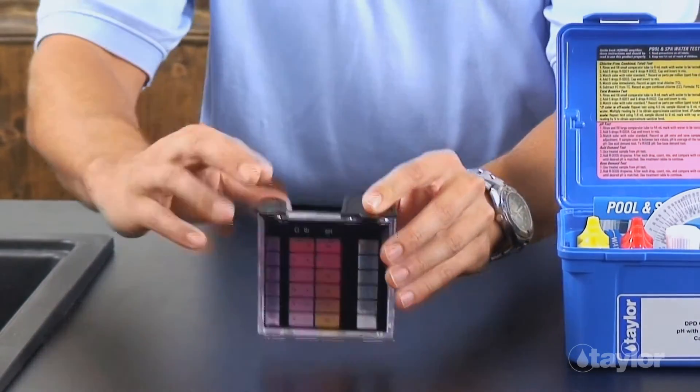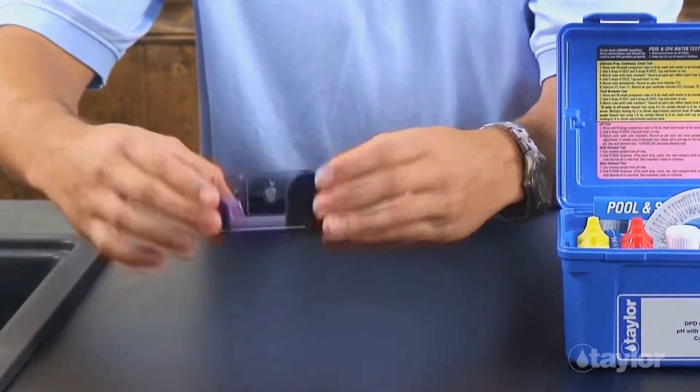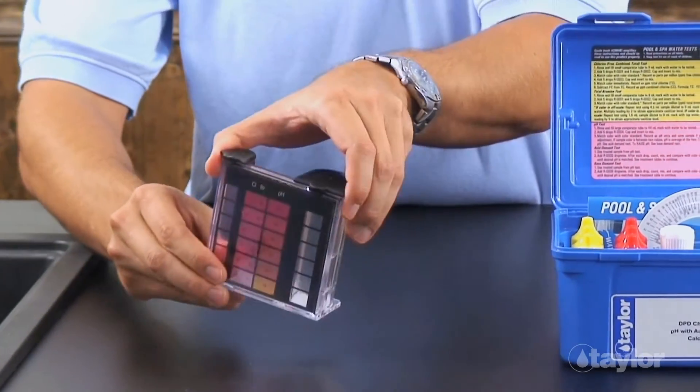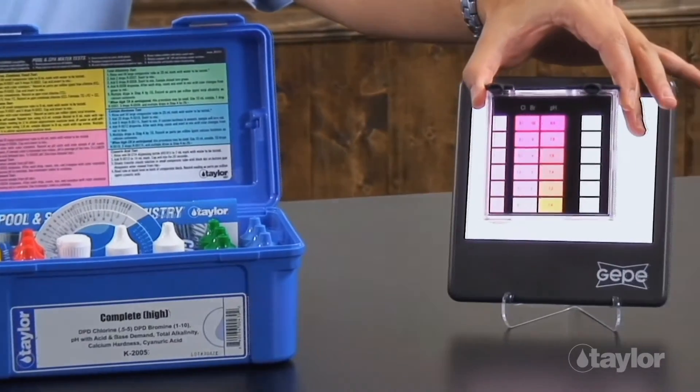Cap and invert to mix. Match the color with the color standard. Record as parts per million total bromine.